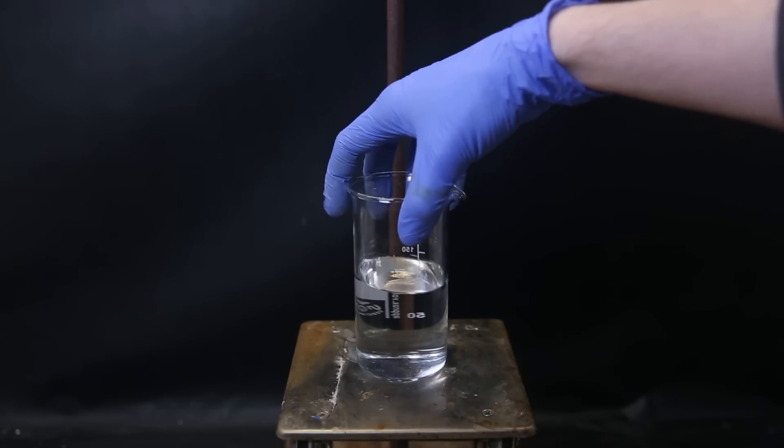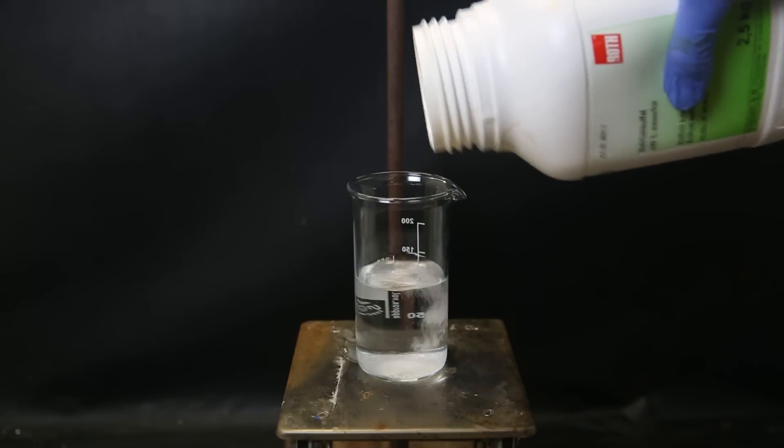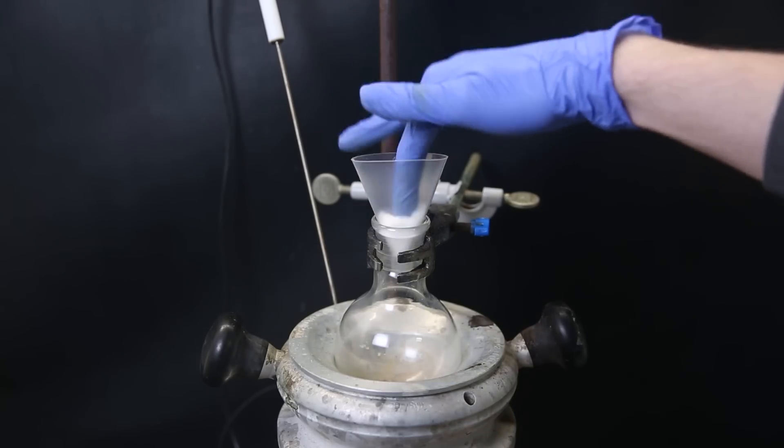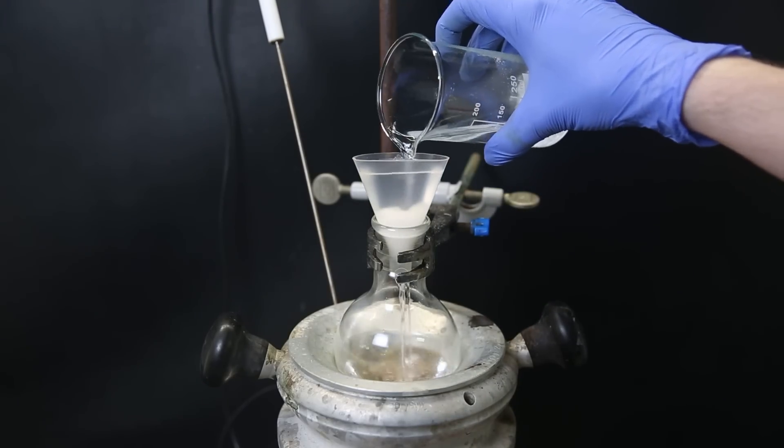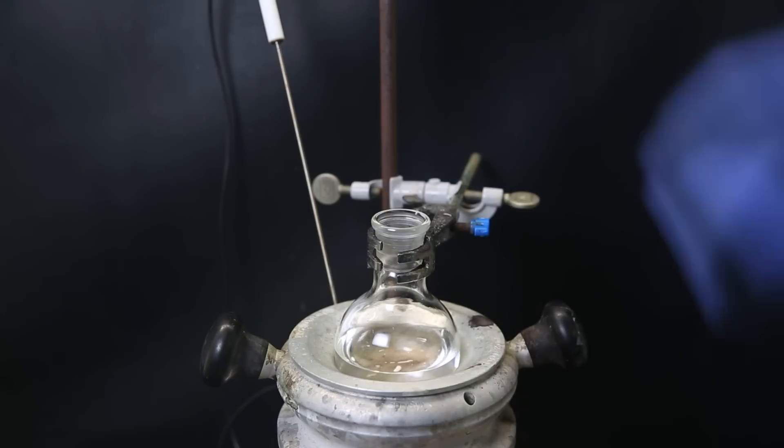Now I have the combined ether extracts that should contain the benzaldehyde, to which I add some sodium sulfate again to absorb remaining droplets of water. I again set up a flask in a heating mantle with a funnel that I plug with some cotton and filter all of the ether through.